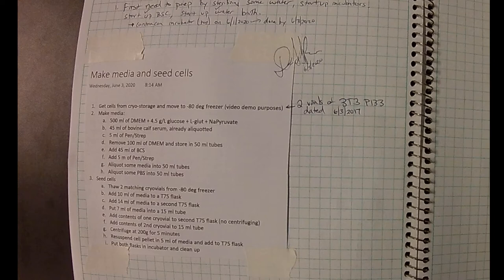And so even when I am alone in there doing stuff by myself, I will tend to write things down first in a physical lab notebook or even just a piece of paper. And then after I'm all done, I'll go ahead and type it into my OneNote notebook. That way I don't have to worry about going back and forth and contaminating my computer with my hands, even if they have gloves and they've been sprayed with ethanol. You don't want to be touching your computer with that after you've just been in the biological safety cabinet.